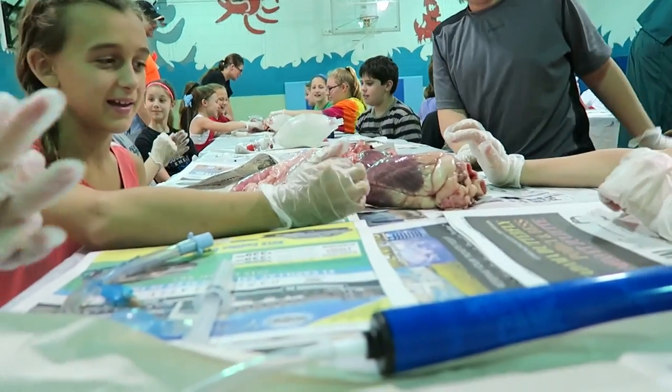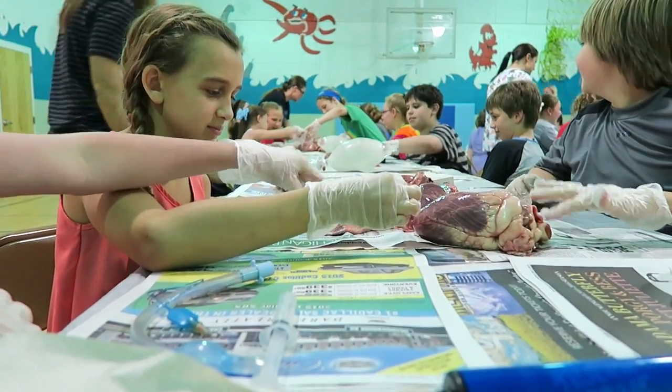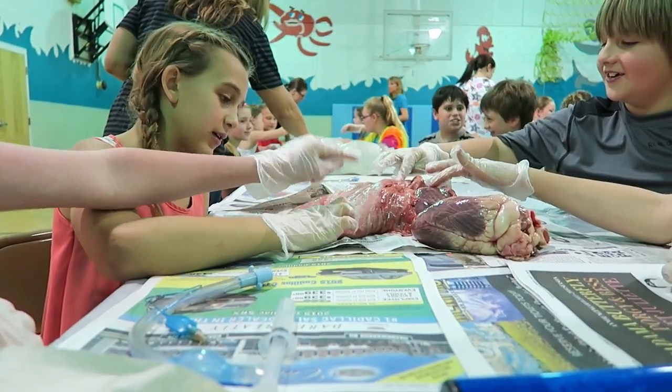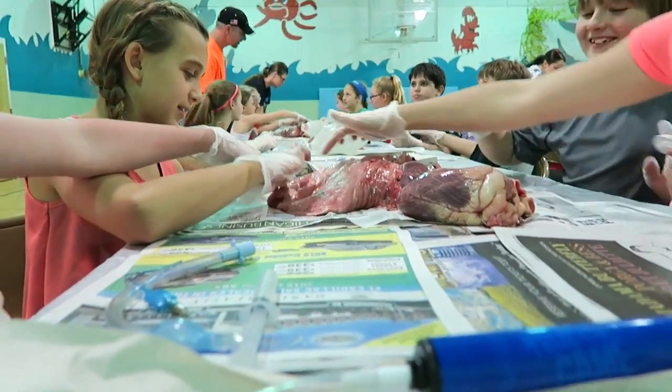What does it feel like, Carly? It's slushy and weird. This part's dry, this part is squishy — it feels like rubber. This is so cool!